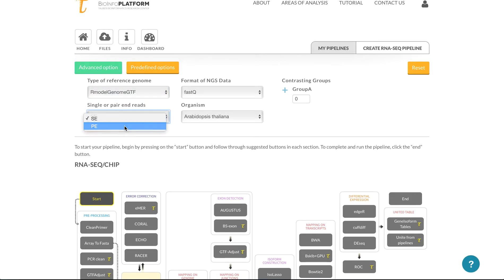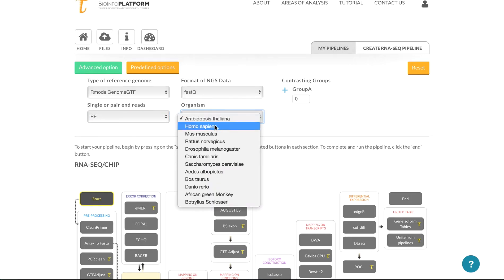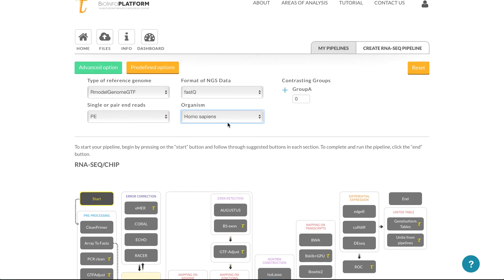Single end pair end, fastq, and then here we can use human. As an example, I'll just create one file per group.